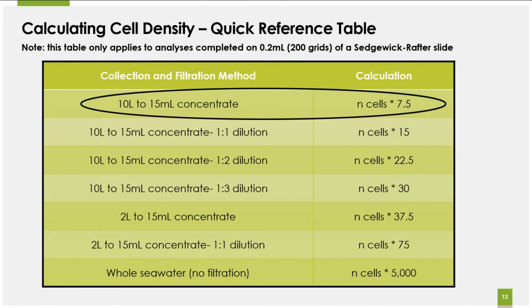And then this is the quick reference table I was referring to. It may look kind of complicated, but if I showed you the math for how we got to these calculations, you'd pull your hair out. If you want to see the math, it's in the SOP. All of the methods behind all of this are in the SOP.